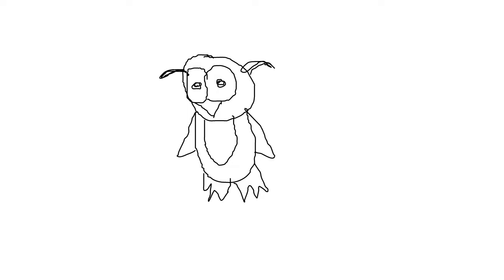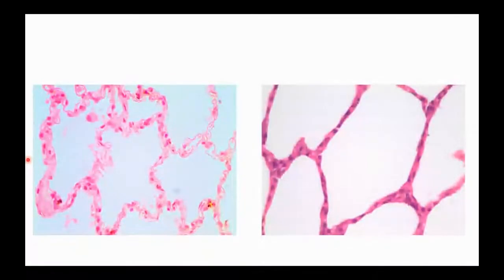Perfect. Okay. So what I'm going to do then is I'm going to switch screens on you, and we're going to start looking at our types of tissue together. So I'm going to kind of go in mostly the same order as is in your packet, not entirely, but we're going to follow it pretty closely. So let me give it a minute to catch up. Are we all seeing my first round of tissues on the screen here? Perfect. Okay, so we are starting here at the very beginning.